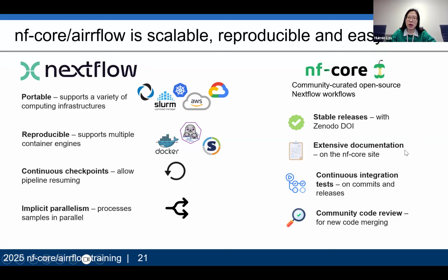And also, the nf-core airflow pipeline belongs to the nf-core community. It follows the rules of the community. So we have very stable releases, and we have extensive documentation. We have continuous integration tests and community code review.